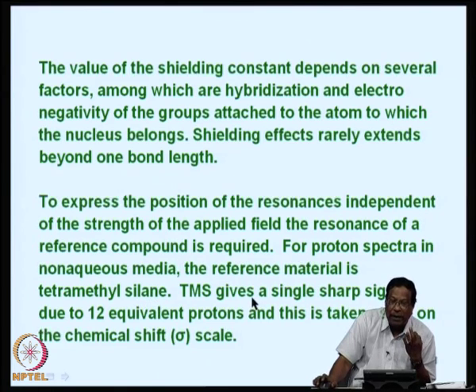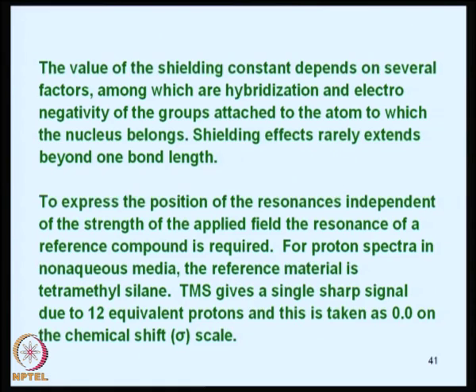TMS gives a single sharp signal due to 12 equivalent protons, and this is taken as 0.0 on the chemical shift scale. That means, you take the spectrum of tetramethylsilane and say this is the 0, the reference material from which we measure the different chemical shifts.